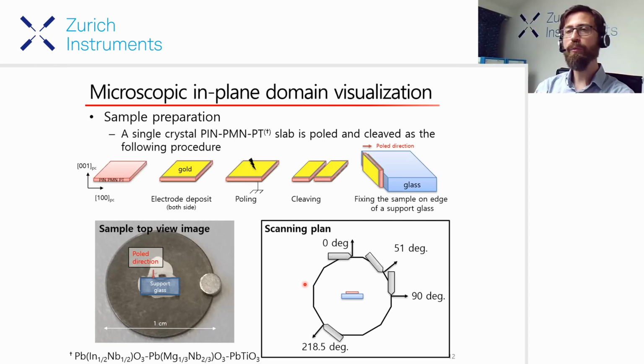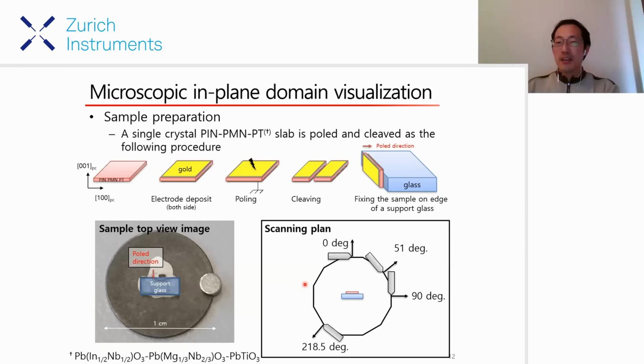So you have some tip wear, so that after a while the image doesn't have the same quality anymore. Most of the time, yes, and that is where you stop. If the tip is nice, I can do more than 4 or 5 or 6, 7 sets. But here, after these 4 sets, the images start to degrade, so I stopped here for this specific example.